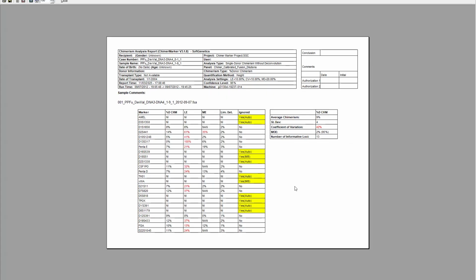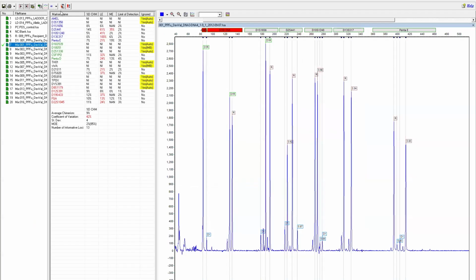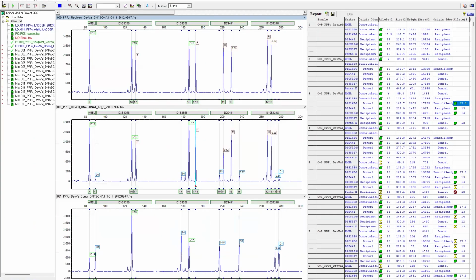There's also an option for graphing of long-term monitoring, and also per long-term monitoring, if we return to the main screen, if a project is reopened, there is an option to add additional samples so that once a project is made for a case, any new samples can just be added to that project and analyzed.